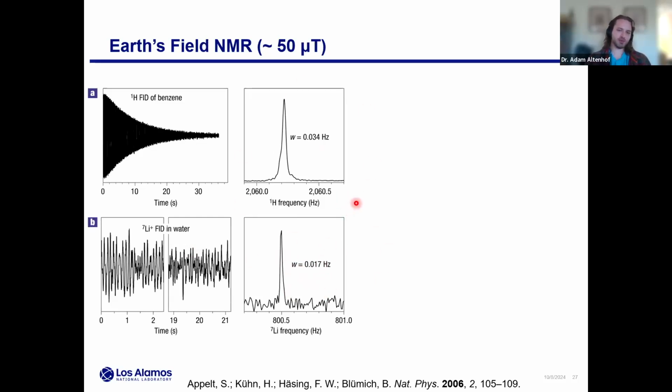This is ultimately afforded by the fact that this Earth's field or zero field or most of these low fields are always going to be much more homogeneous than any 20, 30 plus Tesla magnet. Those high fields will just never get down to the homogeneity needed to achieve these line widths. What's more is that susceptibility broadening effects are extremely low here. Just as field goes down, susceptibility broadening will go down. So that's ultimately why we get these nice sharp lines.